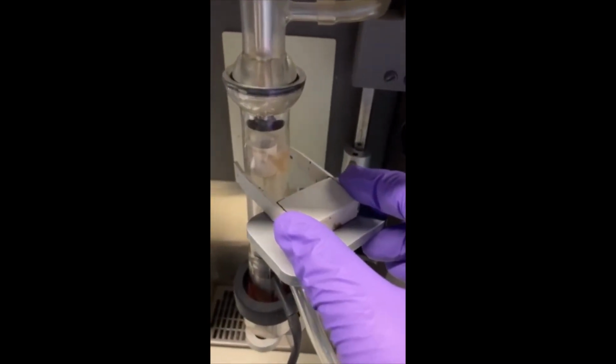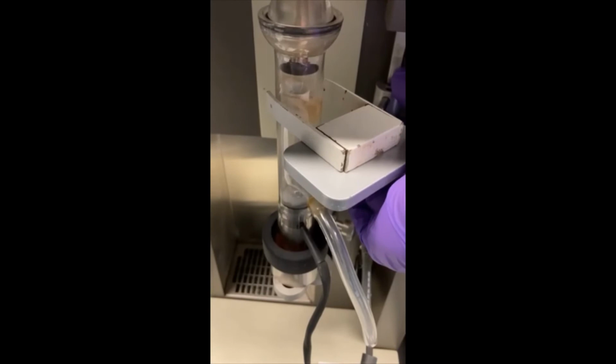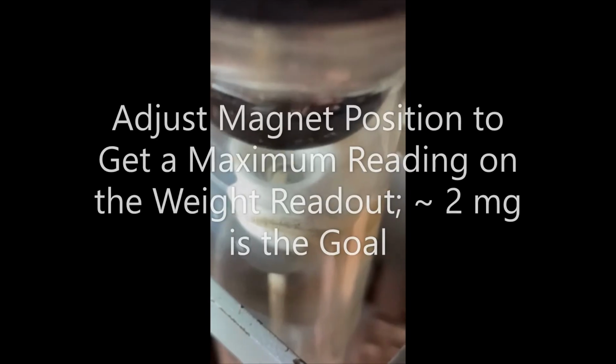Positioning the magnet. Position the magnet on the support platform and position the platform so that the two arms of the magnet surround the sample pan. Position just below the pan height, so that the magnetic field pulls downward on the sample, but the pan remains centered in the furnace, not touching the side walls of the furnace.